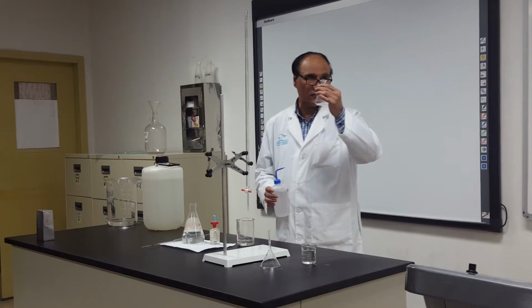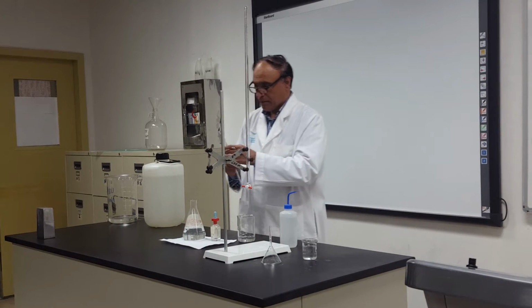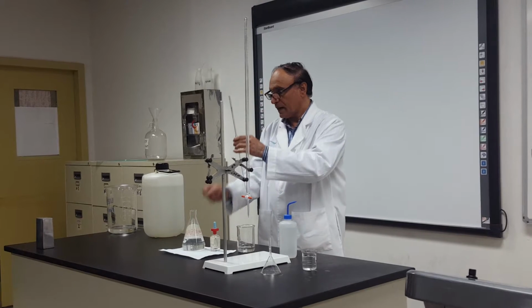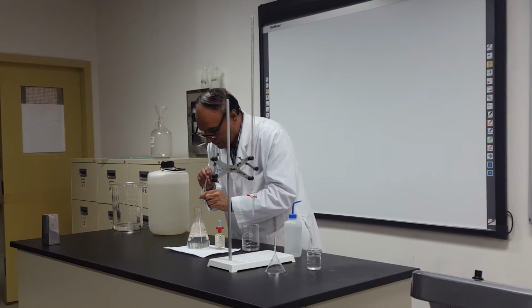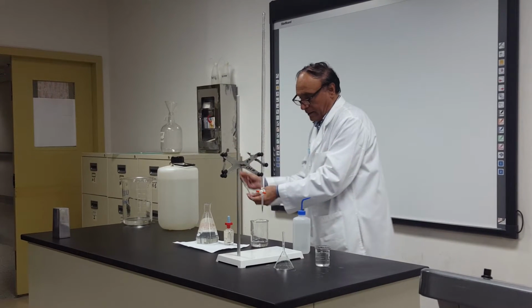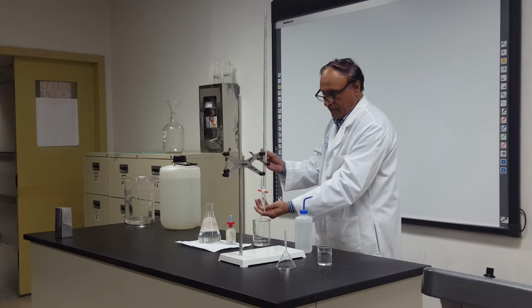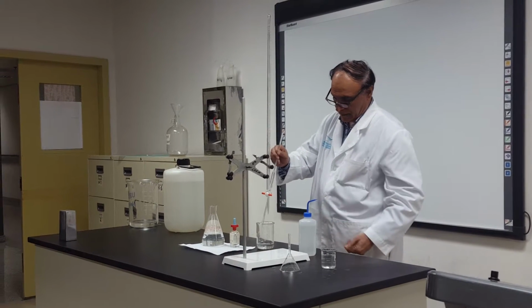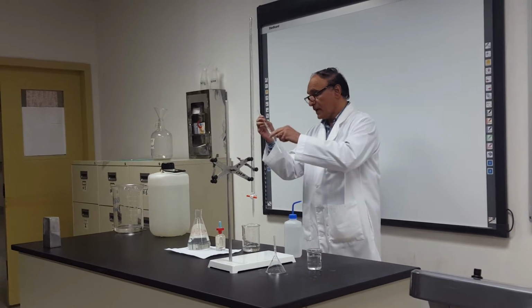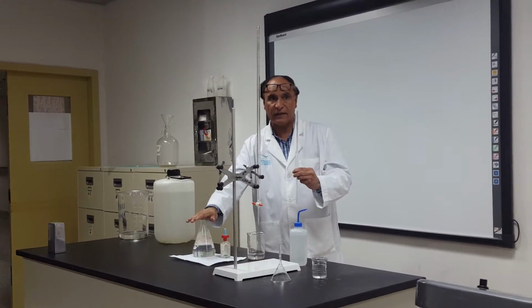This is washed with the distilled water, and now I will wash this volumetric pipette with this solution. I will take some quantity, and I will wash it with this one. Right? This is washed with the acid, vinegar.